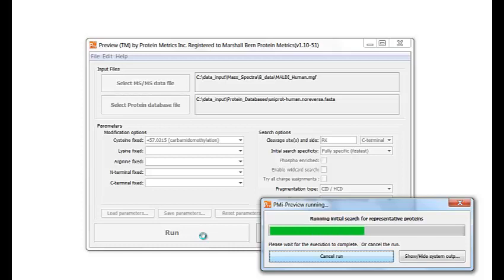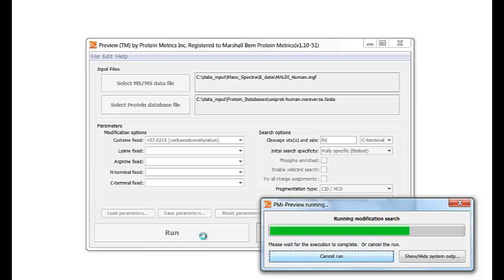I don't need to tell Preview the expected mass accuracy or the variable modifications — the program will figure that out and report back to us. Preview is quite fast. Here it is running 10,000 spectra against a full human database of about 20,000 proteins. It is analyzing the data in numerous ways, including checking for about 60 different types of in vitro and in vivo modifications.